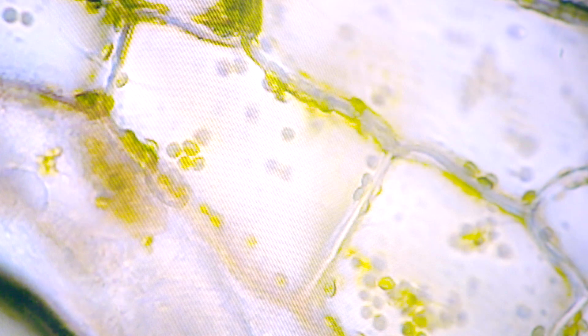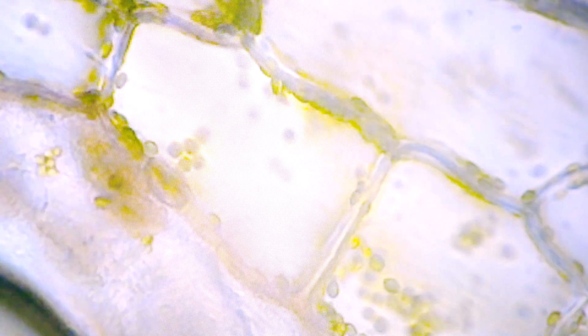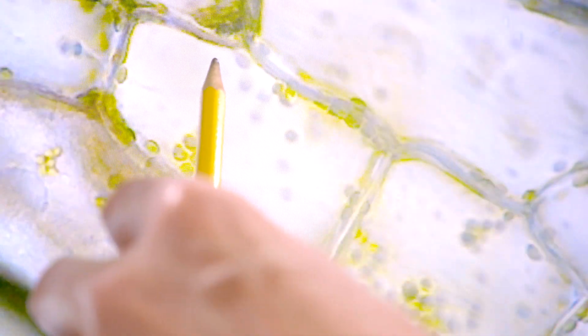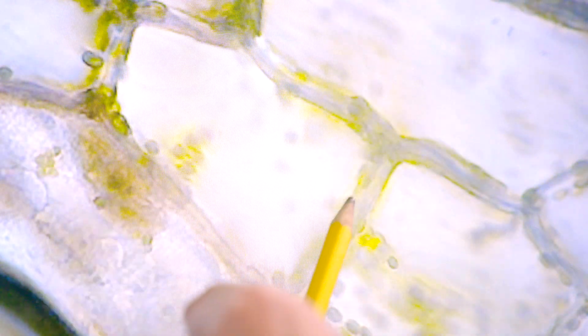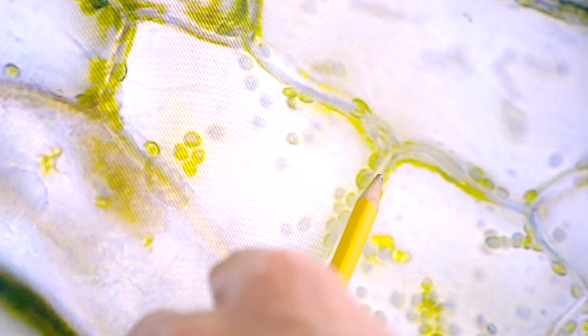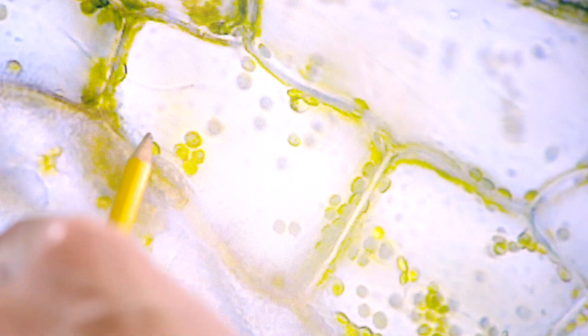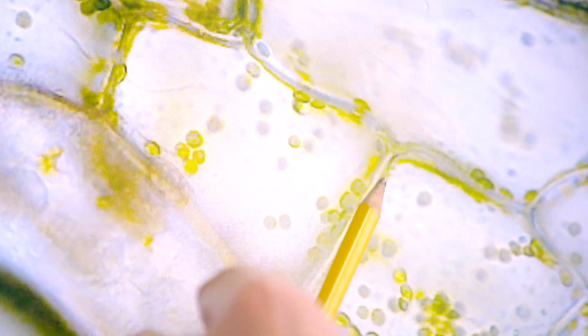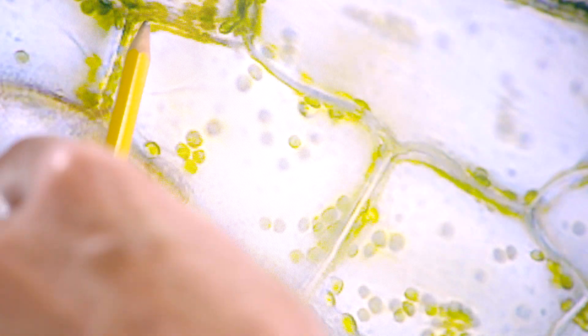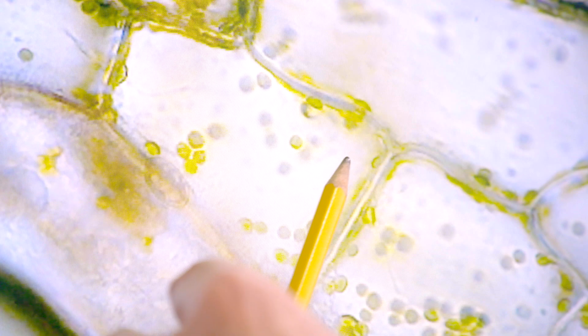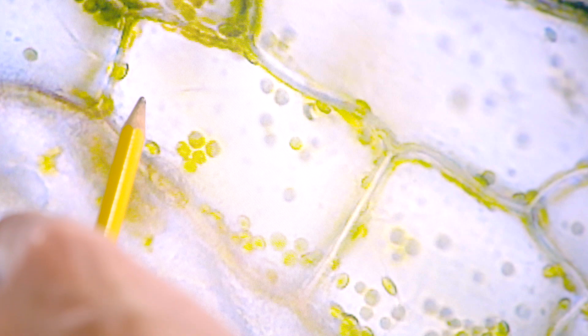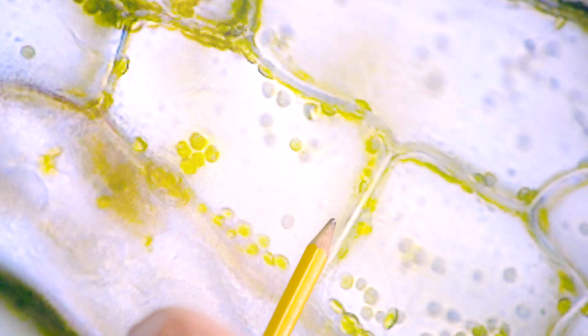Otro aspecto importante que quiero mostrarles en esta imagen que estamos observando acá, son los cloroplastos, que se mueven alrededor de la vacuola. La célula vegetal, recuerden, tiene una vacuola central grandota y estos cloroplastos tienen un movimiento alrededor de la vacuola. Ese movimiento se llama ciclosis. Acá tenemos la pared celular, el citoplasma, y acá tenemos los cloroplastos moviéndose alrededor de la vacuola. Se llama ciclosis.